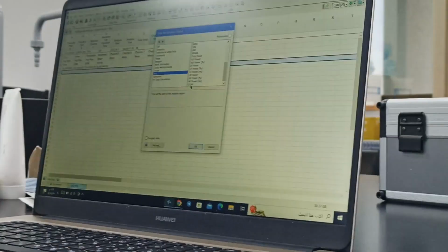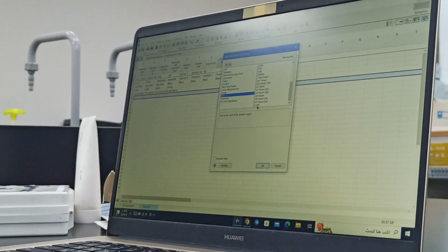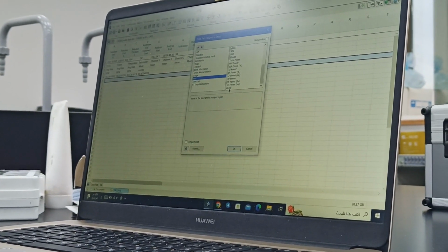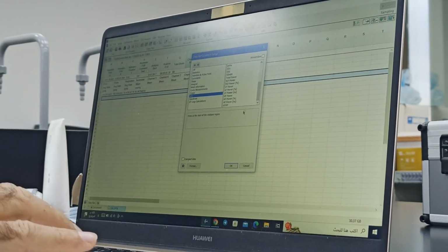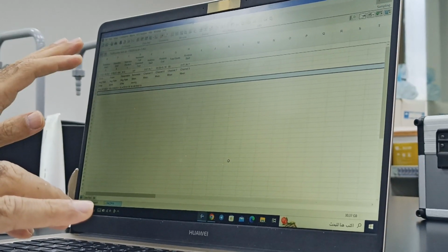Very simple. You are doing a baseline and then you are doing various maneuvers. So all those things are to be done. So 5 minutes, 5 minutes, for the baseline and for the maneuvers. Say for example, you will prepare this file yourself now. I will say okay, these are some of the parameters.